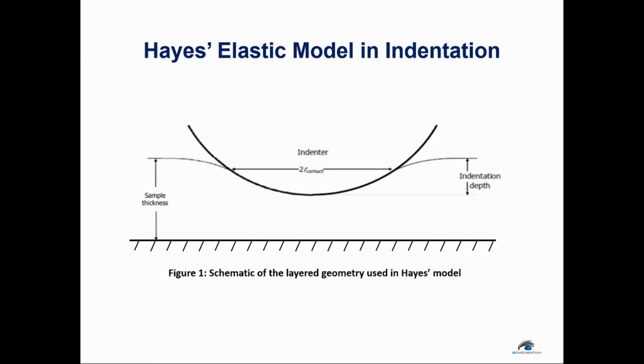The data from the indentation of a 3D sample made of a single elastic material can also be fitted to the model if it is tested while being firmly attached to a solid platform. The effective sample thickness, which is calculated using the needle penetration technique, can be used in this case.